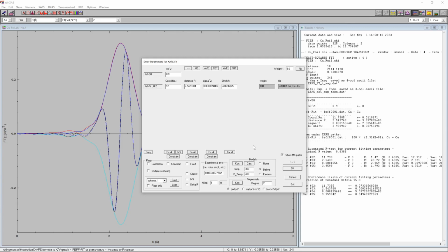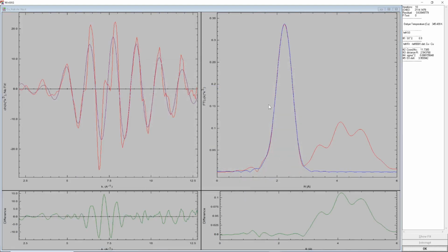So we use the Debye model, we go up here and we select the POT button in the column of the Debye-Waller factor. That changes the color and it substitutes the Debye-Waller factor with the Debye temperature. That is now the parameter that is being refined in the EXAFS refinement. We need to fix the amplitude reduction factor, and now we can just start the refinement.